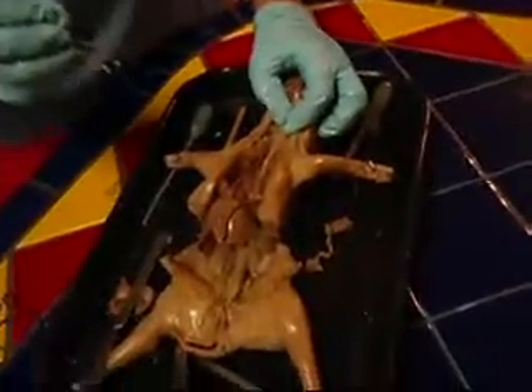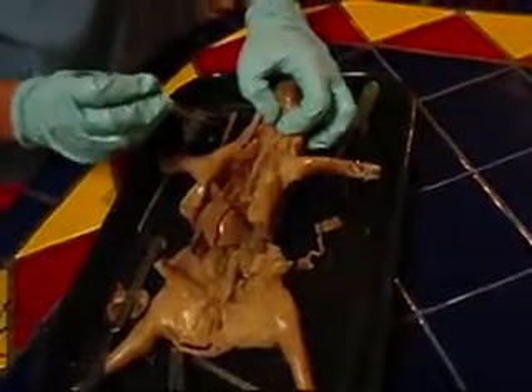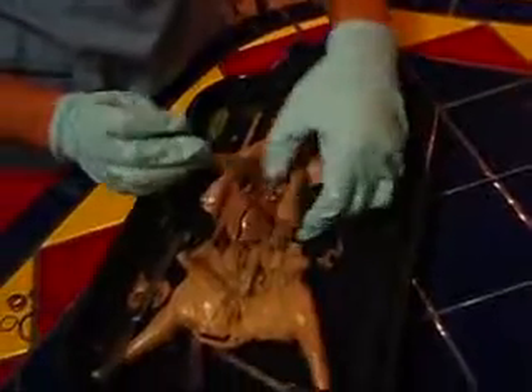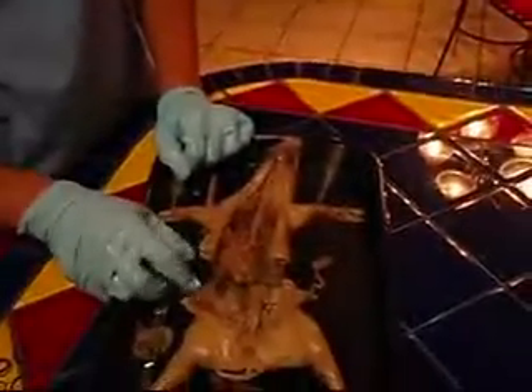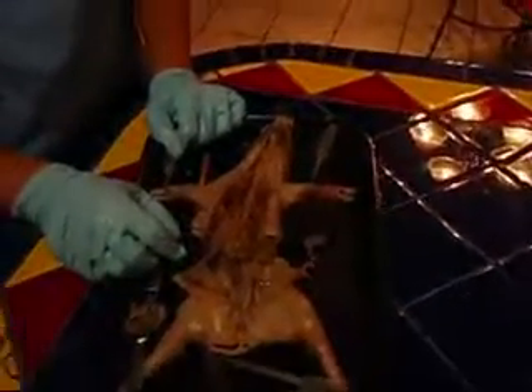After you've located each one of these organs, you should be fairly complete with your pig dissection and free to cut out any of your organs. Thank you.